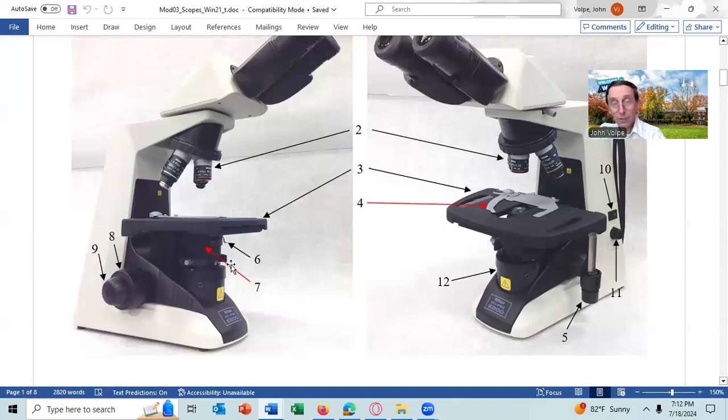And when you get to the 100x objective lens, you should shut down the cone of light essentially to a pinprick, well, a little larger than a pinprick, but something like that. Because that's all the field of view that you can see with the 100x objective lens.